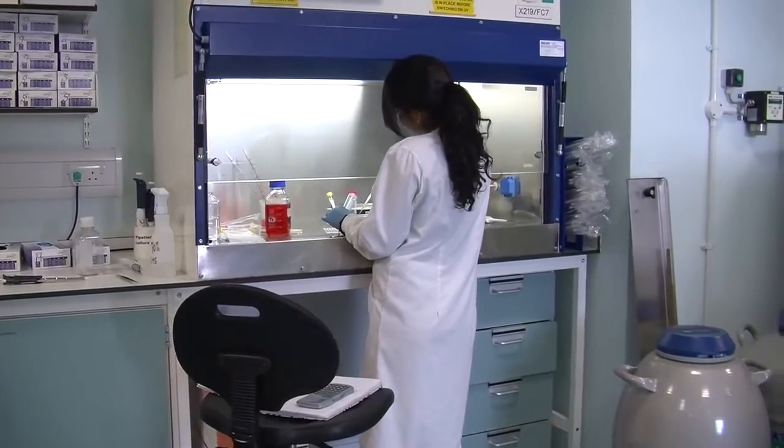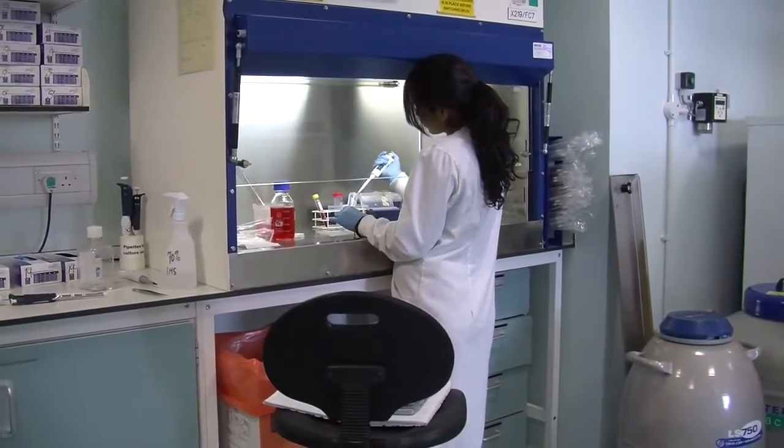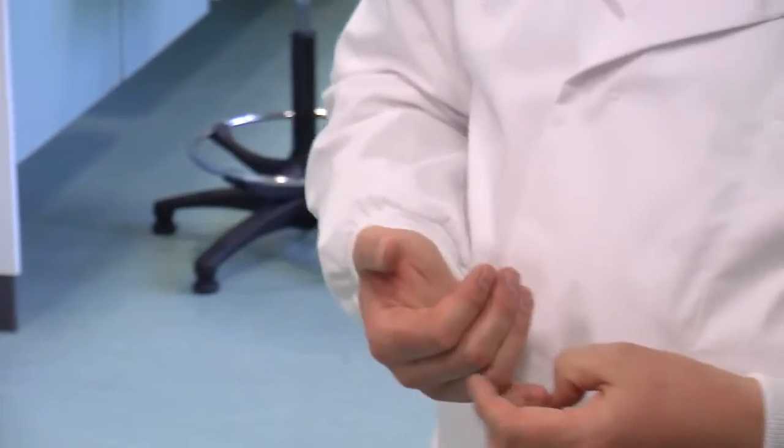Tissue culture, the growing of living cells inside these incubators, is a really fundamental technique and technology for many areas of science. There are two really good reasons why we wish to culture cells in a lab like this. Firstly, we want to culture cells on materials to predict how the living body would respond to that material. This often cuts out the use of animals in research, and if we're using human cells, there's a much clearer idea about how the body is going to respond to a new material.